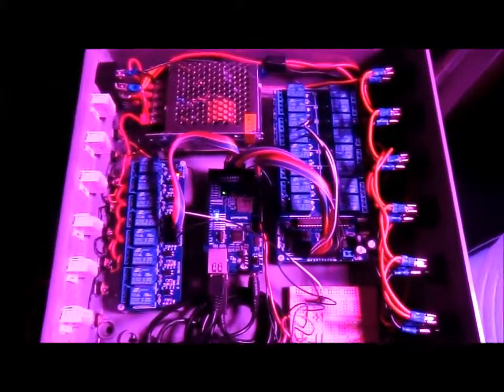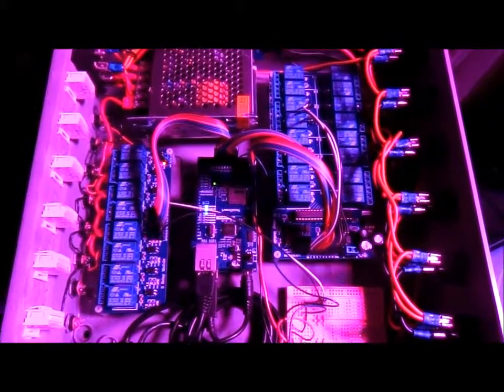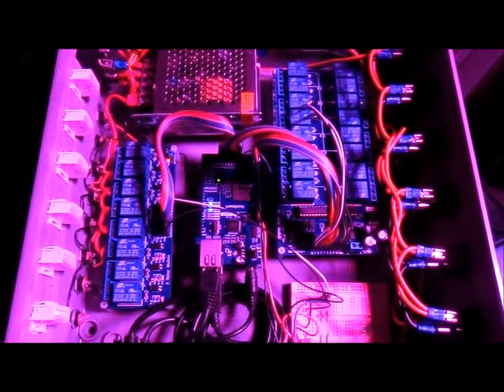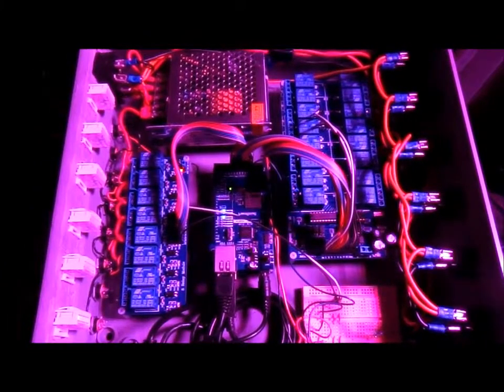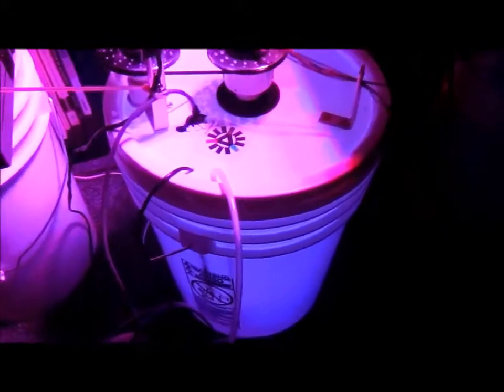So that's been taking quite a bit of time to do all that wiring and figure out everything and make sure you do it correctly. No small feat for me, but really happy to get this all going.